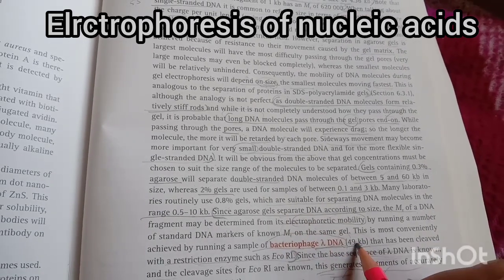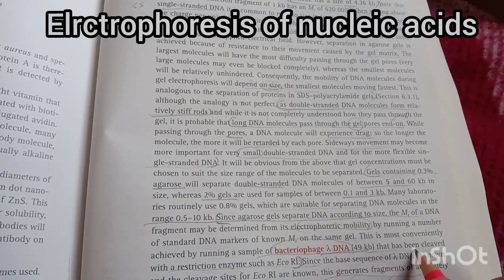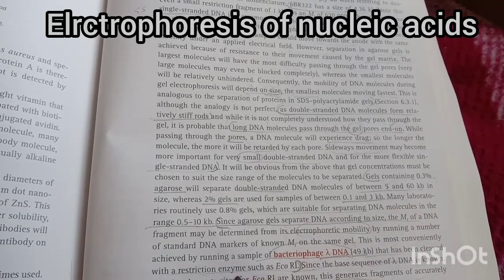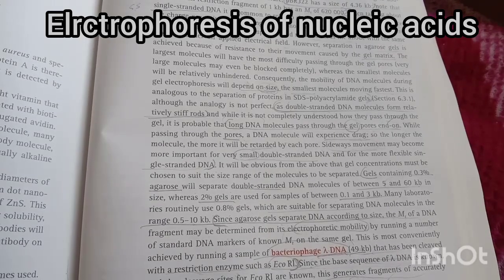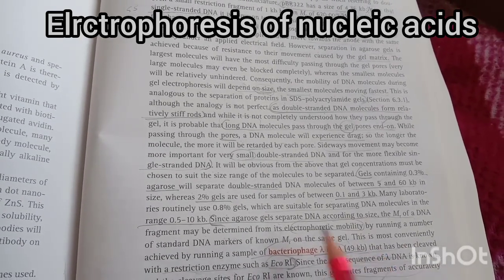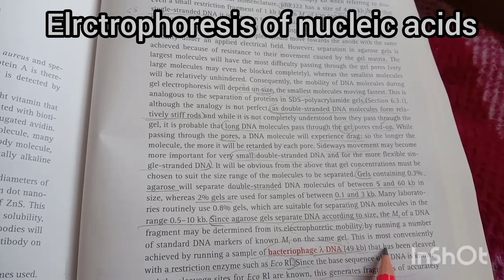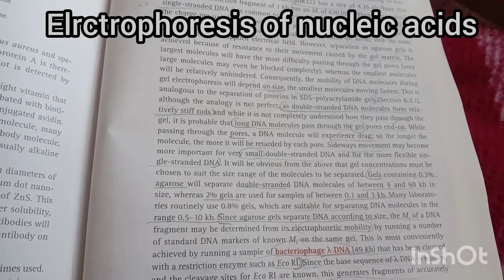That size is 49 kb. Bacteriophage lambda DNA is cleaved with restriction enzymes such as EcoRI. Since the base sequence of lambda DNA is known, 49 kb, and the cleavage sites of EcoRI are known, this generates fragments of accurately known size.